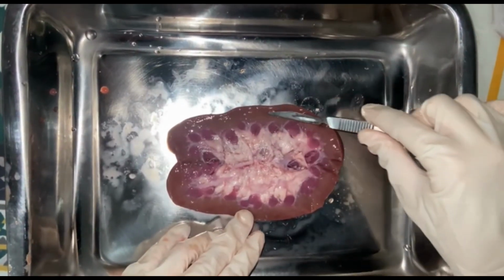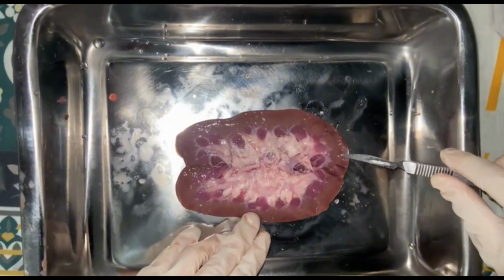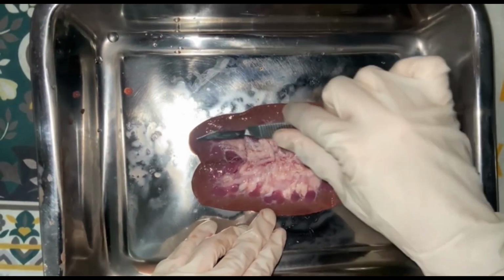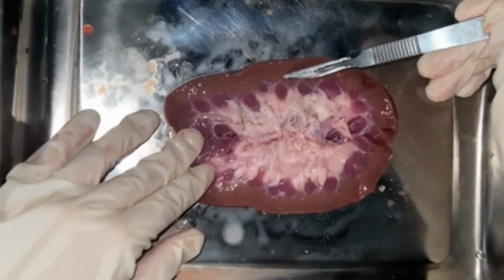Inside the kidney, this outer layer is the renal cortex, the solid-looking outermost part of the kidney. It contains many small arteries and veins that carry blood to and from approximately 1 million nephrons located in the cortex. As we move inwards, we can see the renal medulla.